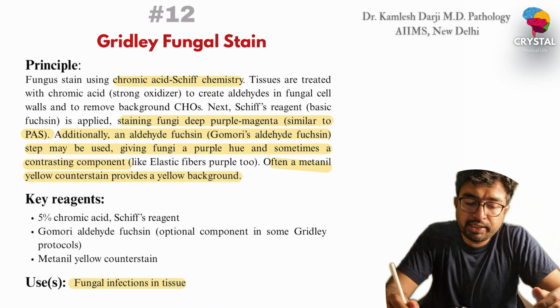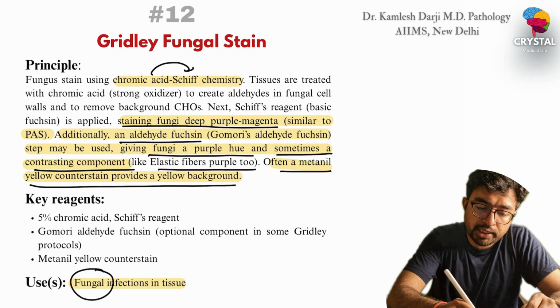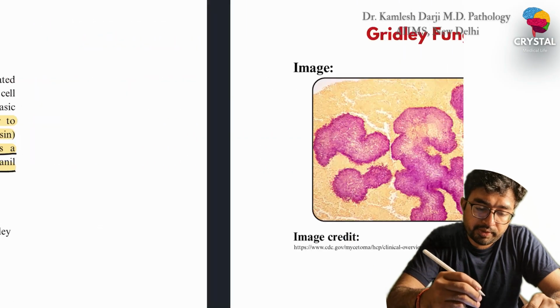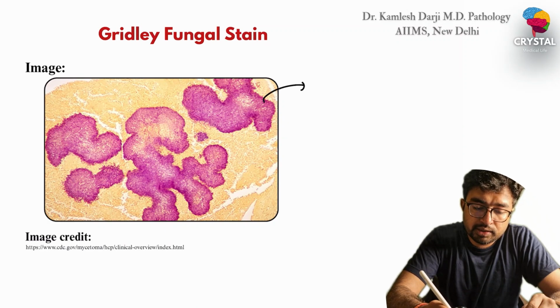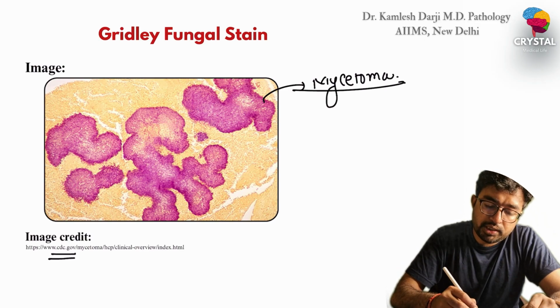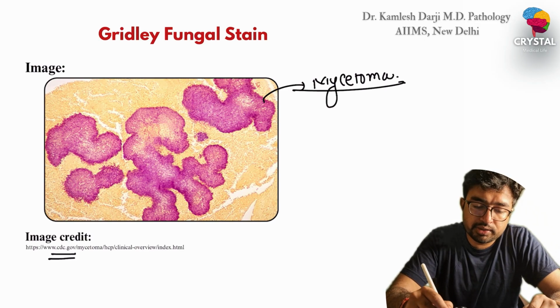Next stain is the Gridley fungal stain. So you should know that there is a fungal stain called the Gridley. And you can see here, this is mycetoma. And this image is from the CDC. This is a Gridley fungal stain.